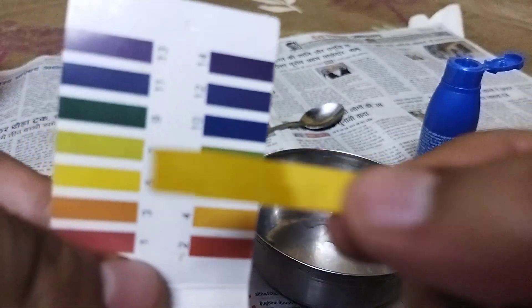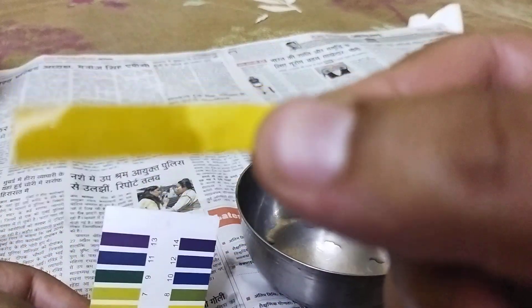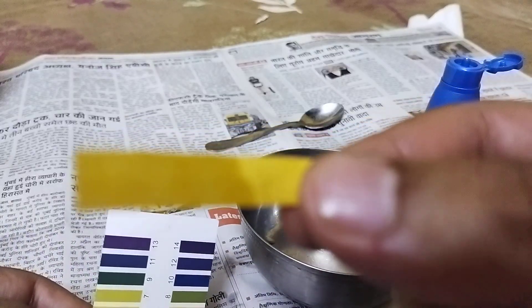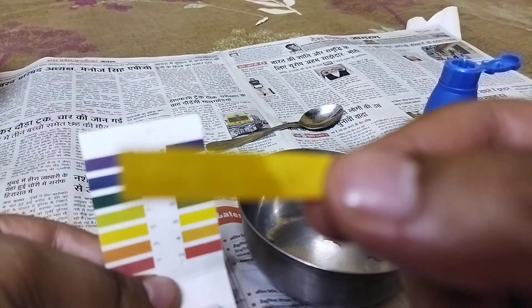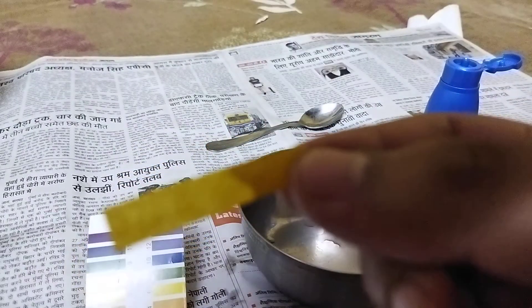If you see closely you will see that it is slightly green in color. Let me show it more closely to you. It may be looking orange from your perspective, let me adjust some things.